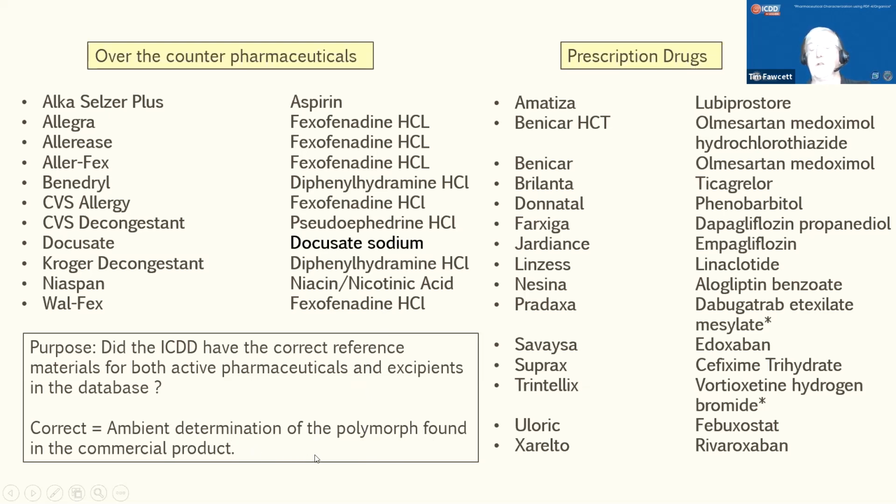The other thing I'll specify is ambient determinations. Most of the time, you're doing a room temperature analysis and you want the reference materials that you have to be ambient determinations so that you can go through the identification process successfully.